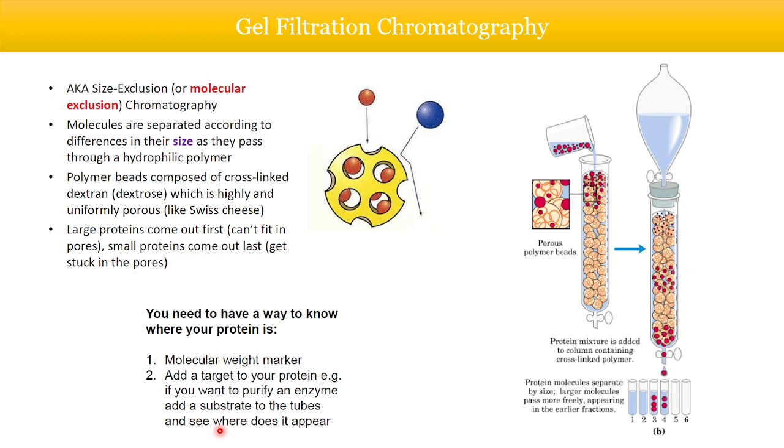The other way is that you know the molecular weight of your protein. Let's assume that, and then there are different standards of proteins that are run alongside it that will help you to know that, okay, this is the molecular weight of that particular protein, so the size of my protein is in between, say, 12 and 20 kilodaltons. So that is all about gel filtration.